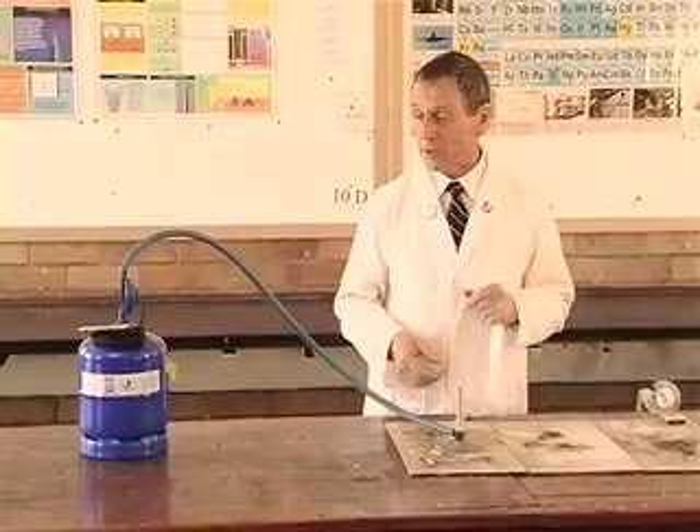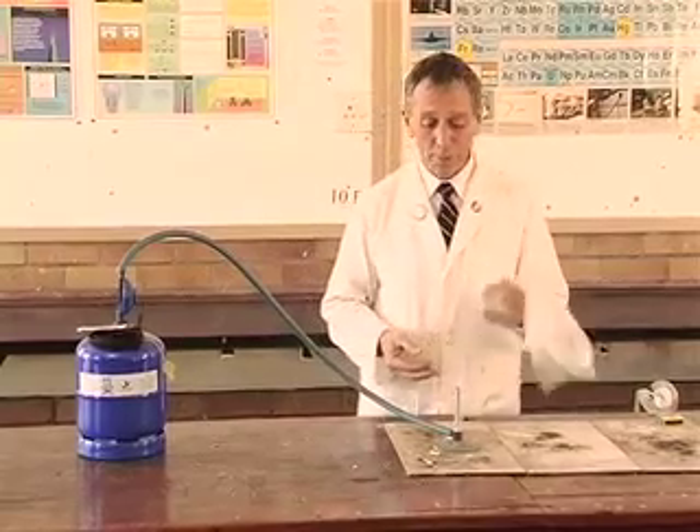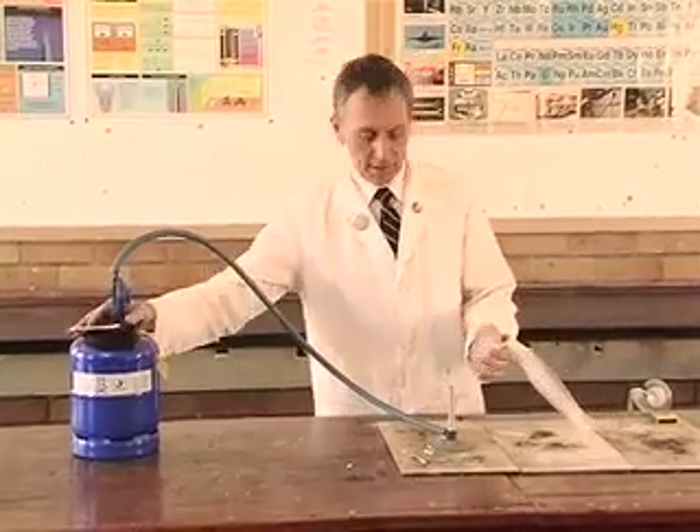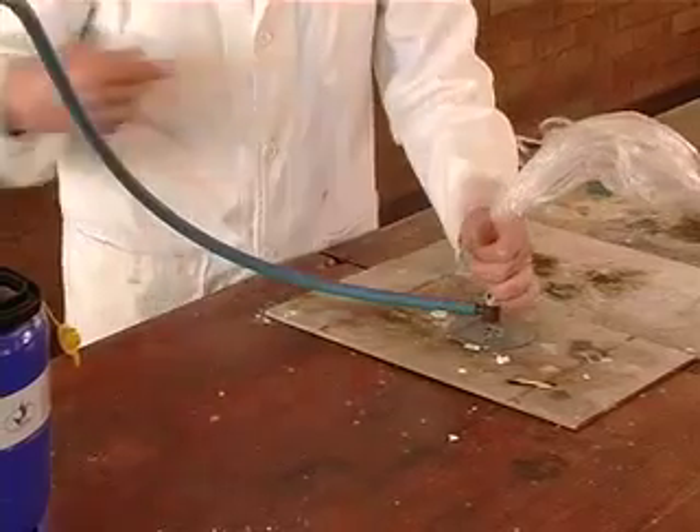For this experimental demonstration we're using some calor gas. I'm going to fill the bread bag with calor gas and let's just get this over the mouth of the Bunsen burner. I've closed off the air vent there.